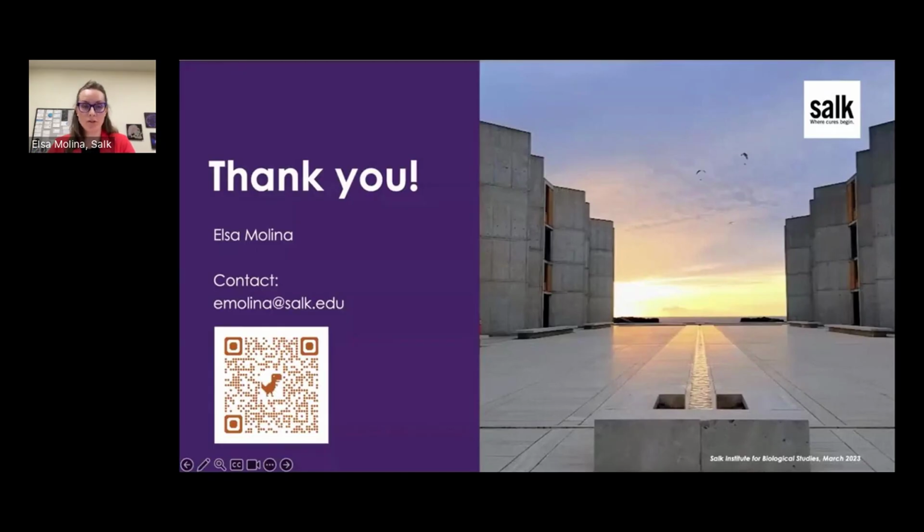When you want to compare the same data, for example, if you have run the same tissue on different platforms and then you want to normalize the data, I think you should normalize based on the area, because, as you've seen in the presentation, you don't capture the same area on different platforms.